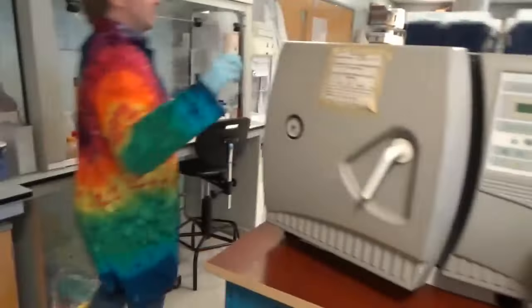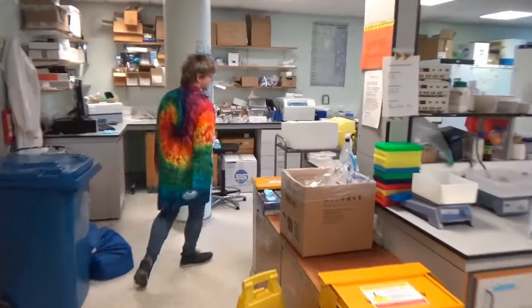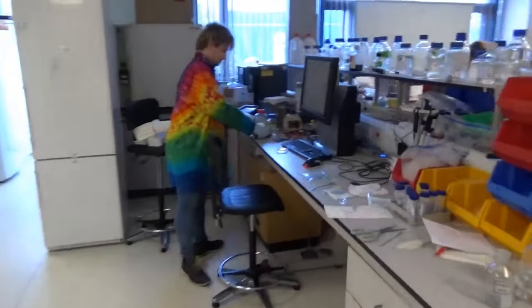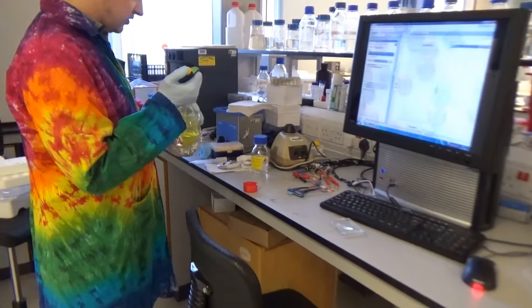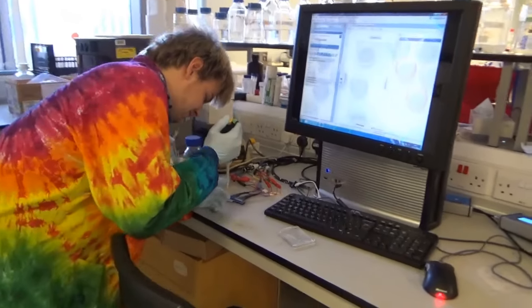Once I've done that, once I've added it to the electrode, I have to run the scans on it. And to do that, I've got a setup over here. It's not the most rudimentary setup, so I apologise for that. But what I do is I essentially put on an electrolyte. It's called ferrocyanide. It's got cyanide in the name, but trust me, it's perfectly safe.